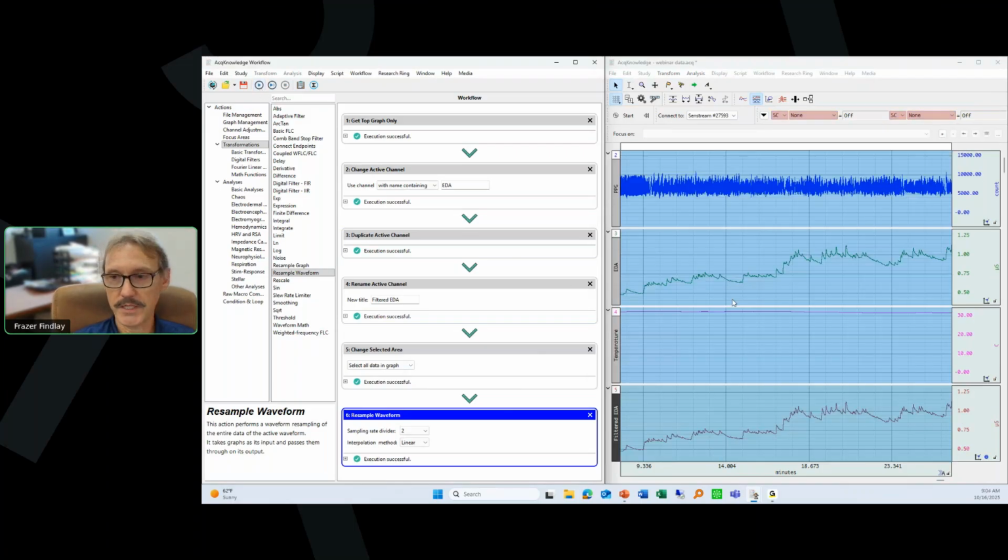Now, the advantage of this is this adds to greater standardization within the lab, because every person that runs this workflow, the workflow is going to be performed the same way every single time. Whereas if you have a standard operating procedure and you've got 3 or 4 people all analyzing and preparing data, they all may do things subtly differently, but this eliminates that. This will allow you to control that level of standardization.